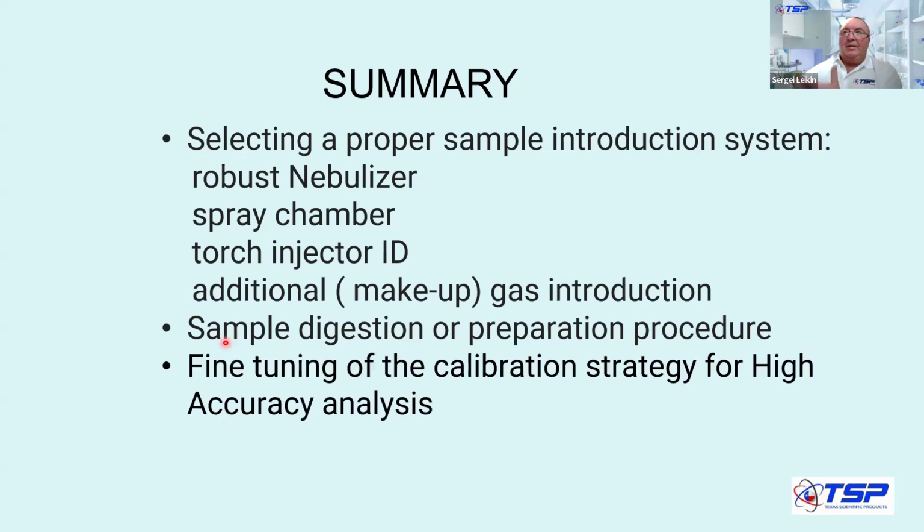If you run high accuracy analysis, look at your calibration data, your residual error or relative error in percentage, depending on the terminology used by your ICP manufacturer.